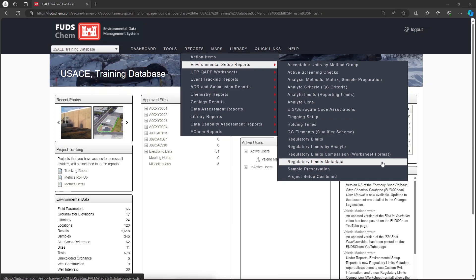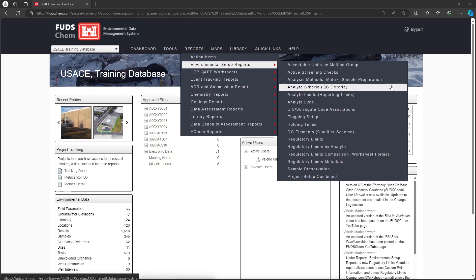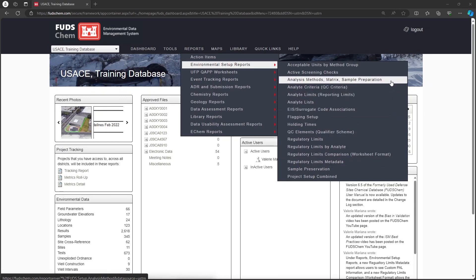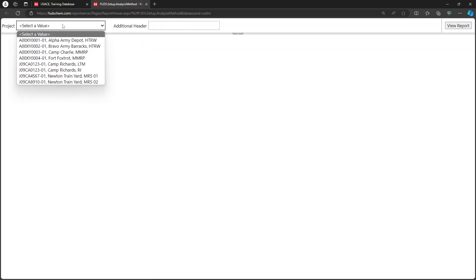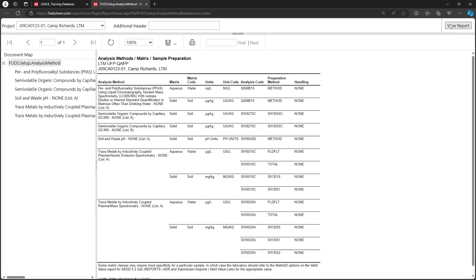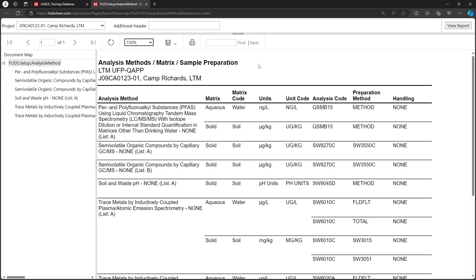Choose Analysis Methods, Matrix, Sample Preparation. Choose the project, then click View Report. This report indicates which methods, matrices, and units have been set up in the EQAP.